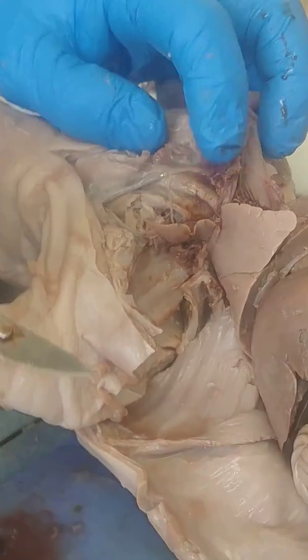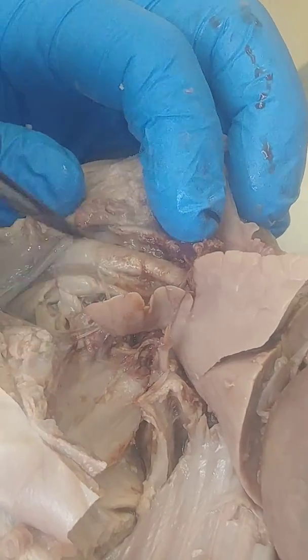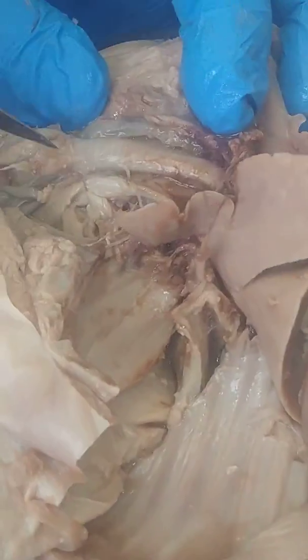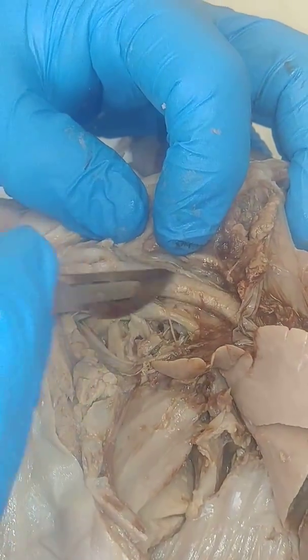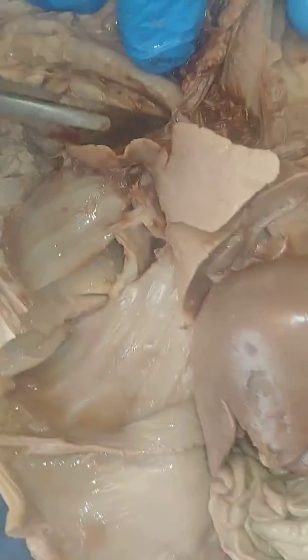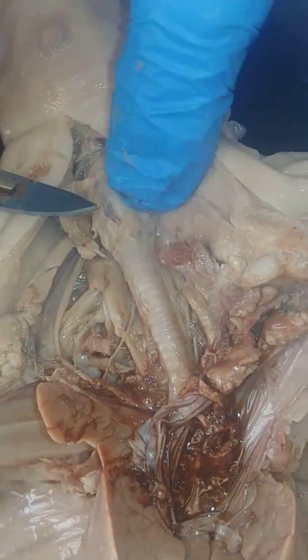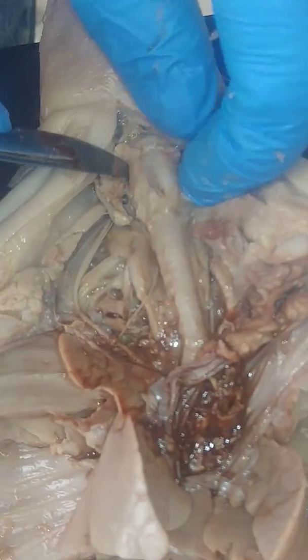Okay, this tube right here, going to kind of trim loose a little bit. Kind of looks like a straw. This is the trachea. And I can feel that it's rough. You have little rings all around here, but that's what's bringing the air from the mouth and nostrils down into the lungs. This enlarged area up here is the larynx.